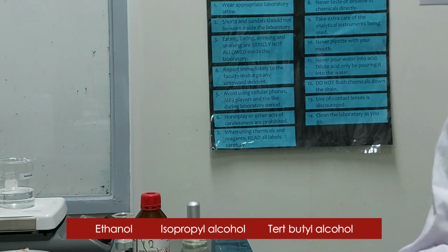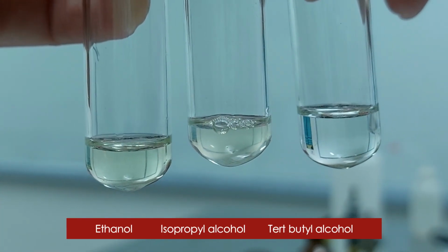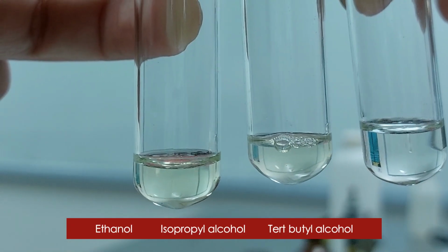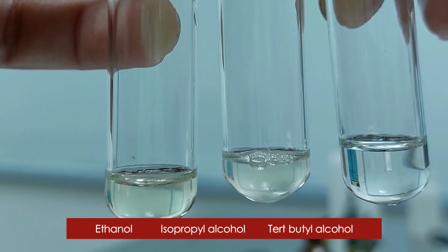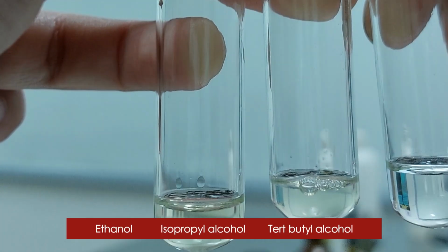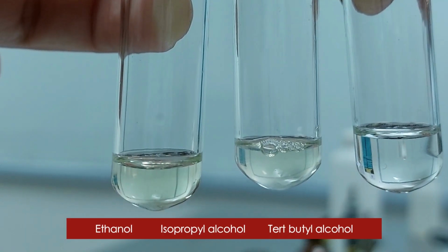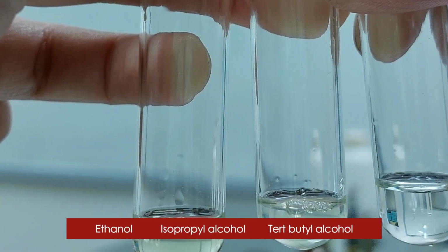So in other words, the ethyl alcohol, the primary alcohol, exhibited the slowest reaction, while the tertiary exhibited the fastest reaction in this case. So you should be able to explain why tertiary can easily undergo substitution reaction compared to secondary, faster than primary. That is the sequence.